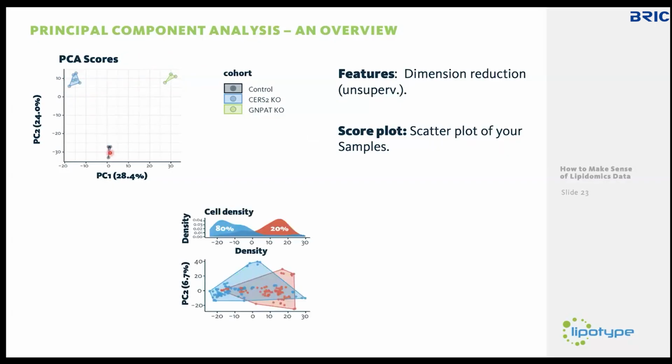We had an example where we measured a screen and had many samples, which we measured at different cell densities and standardized to total lipid amount. So the lipid amount was in both cases 100%, but we noticed that if we took both of these groups from the screen into the same PCA, the major difference, which is the first principal component here, showed a large separation between the denser cells versus the not so dense cells.